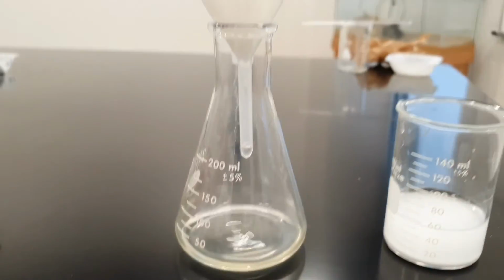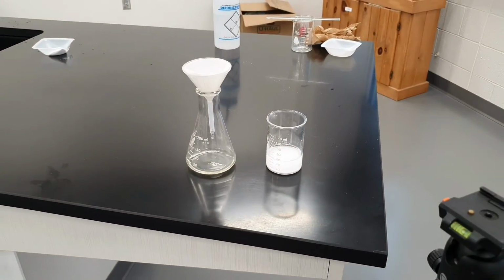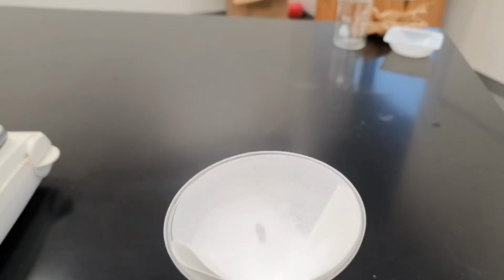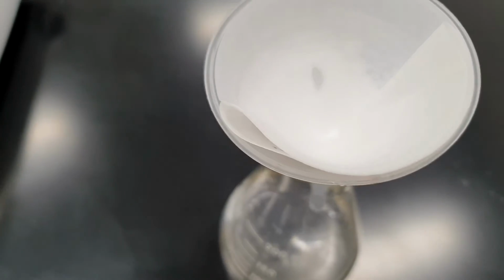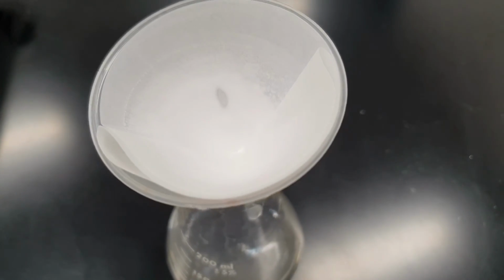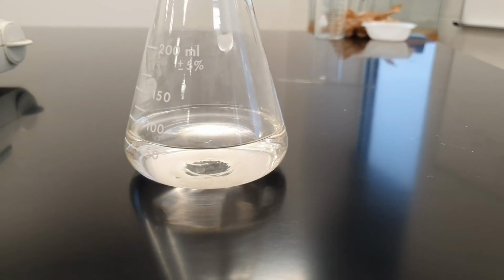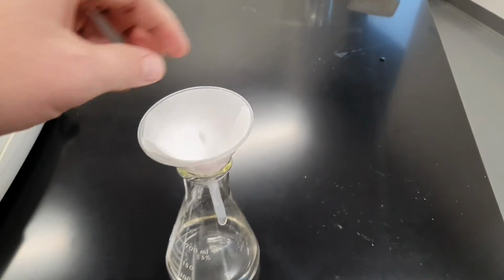All right, so instead of sitting here and watching this the whole time, luckily with the power of YouTube, we'll come back when this is all filtered. And here we are back after it's filtered. If we look up here at the top, you can see definitely that there is a white solid that was not there before. And if we look down at the filtrate solution, we can see that it is clear. So what we wanted is on the top of this filter paper.